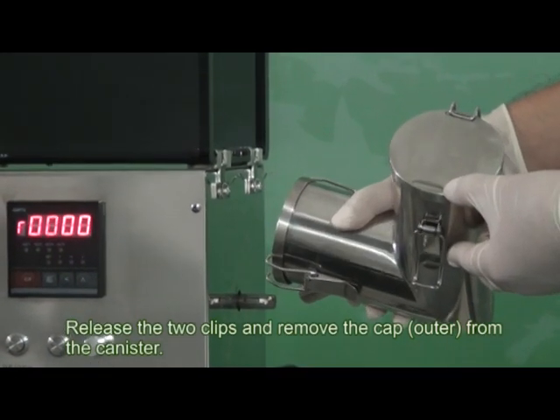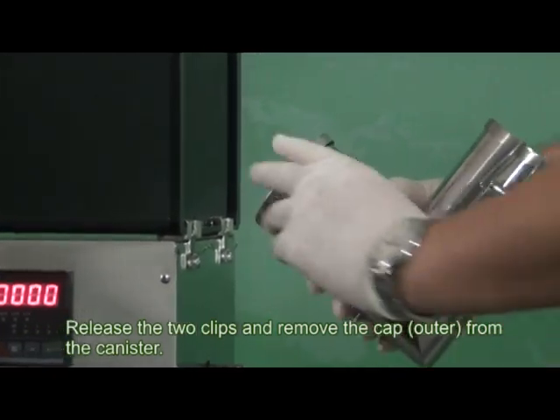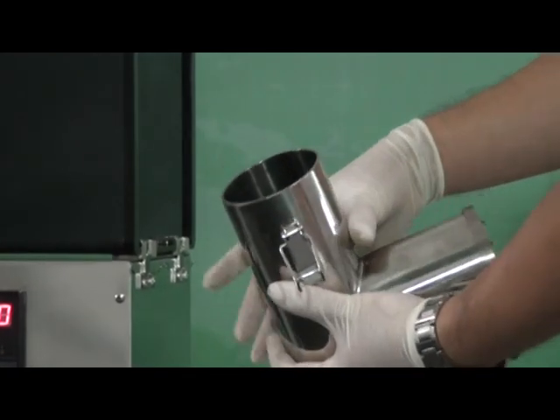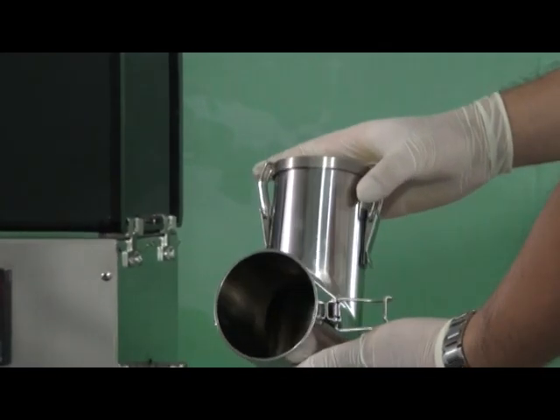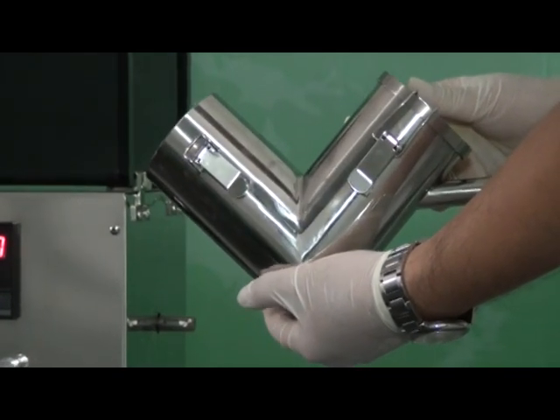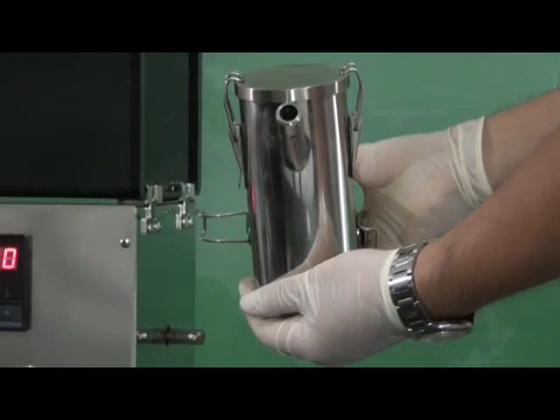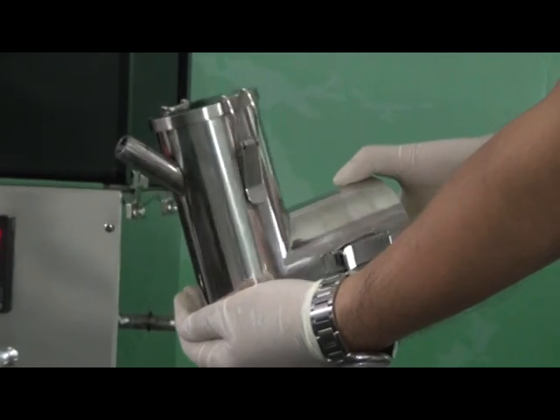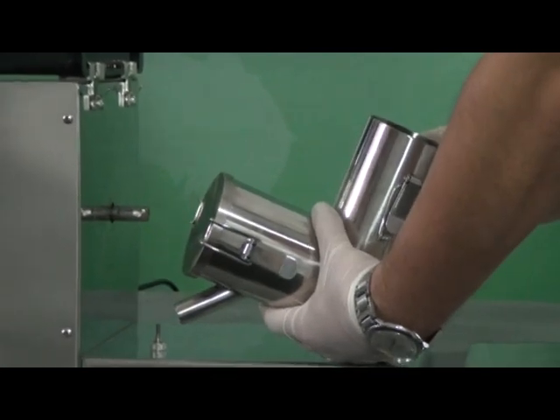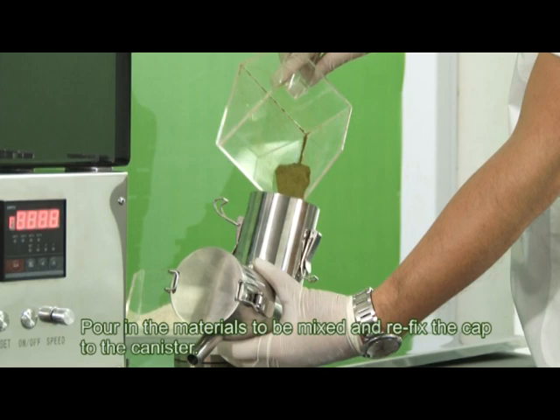Release the two clips and remove the cap from the canister. Pour in the materials to be mixed.